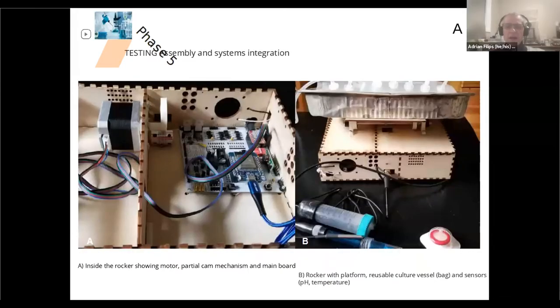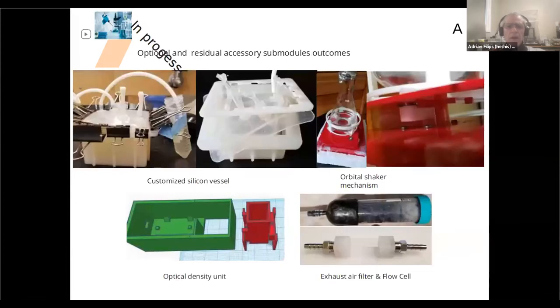This is a look inside the box. You can see the electronics, the turkey pan where we put the actual bag, a couple of temperature sensors, and a pH sensor in the front. This is kind of how it looks now — of course it won't be made of wood. We also experimented with pouring our own silicone containers, and you can see that on the left corner, it actually works. You can see some additional projects: an orbital shaker, an optical density reader, a flow cell, and exhaust filters to cut down the smell of E. coli.